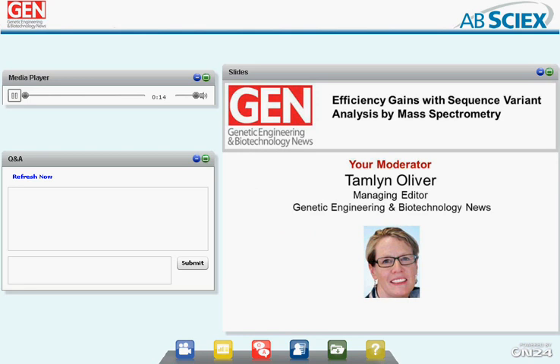The need to efficiently detect and identify variants of all types has grown rapidly. Our speakers today will talk about how modern mass spec and informatics can provide efficiency gains in sequence variant analysis. They will also discuss how the continual use of accurate mass data with informatics can inform the clone selection process and how LCMS can be incorporated into the clone selection process. If time allows, they will be available to answer your questions on best practices as well.